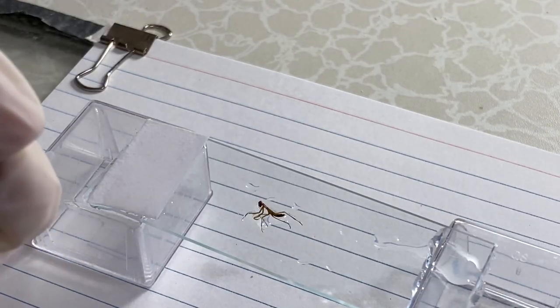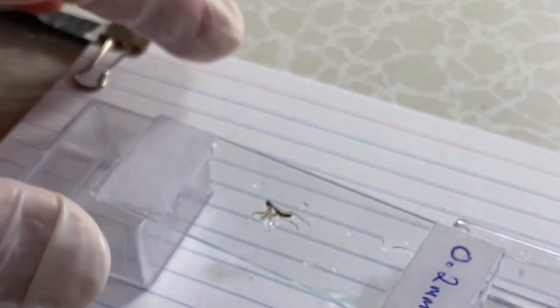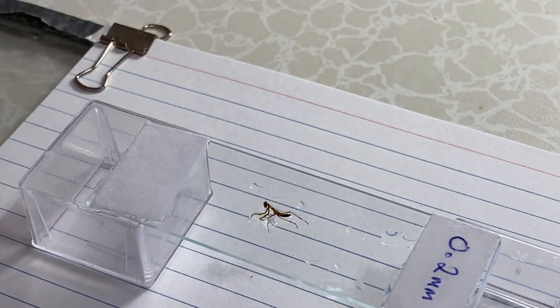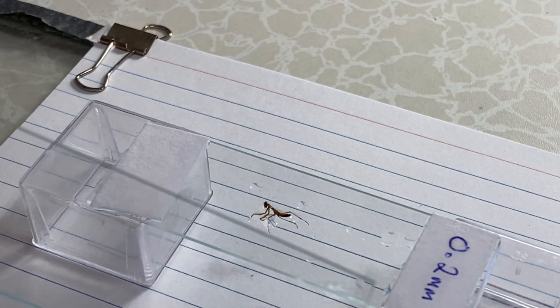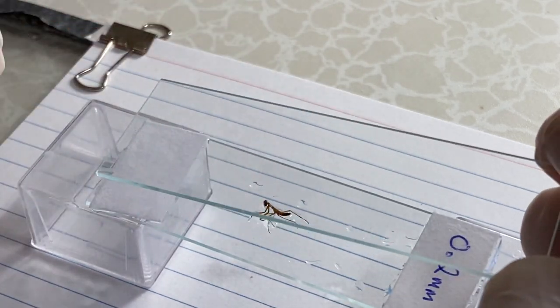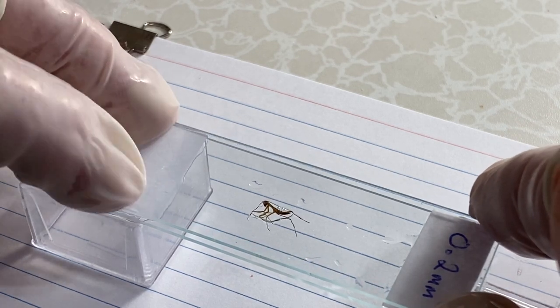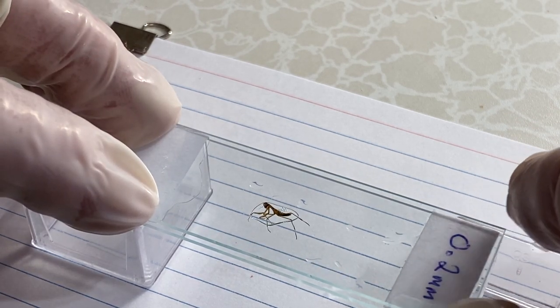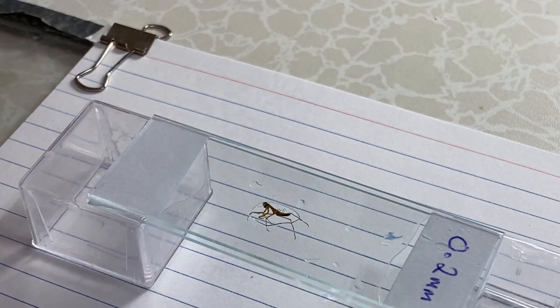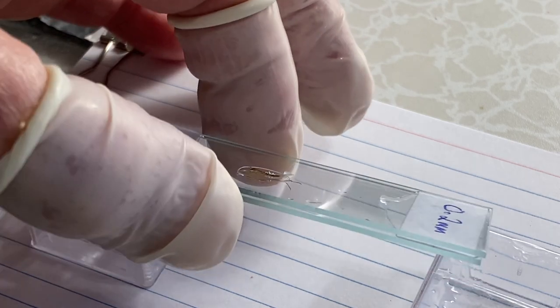An index card is about two tenths of a millimeter in thickness — I measured it. You place it on the end of the slide like that, then take a second slide and place it on top of the other one very carefully. As you go down it'll squish the insect a little bit.